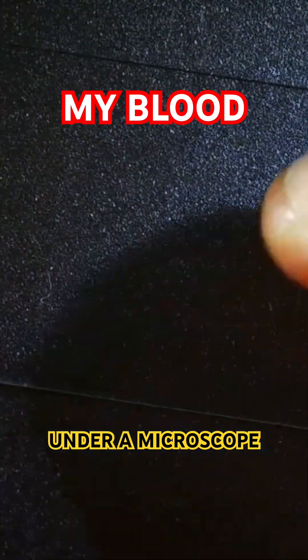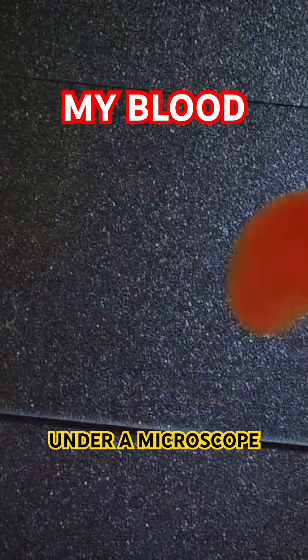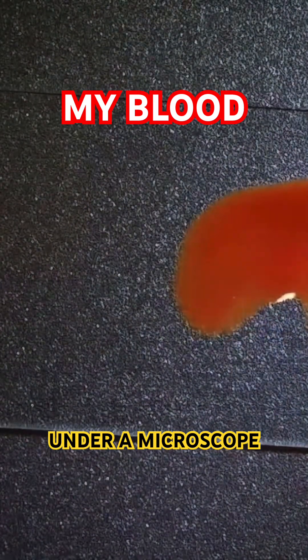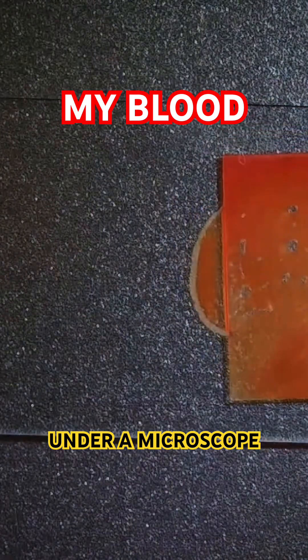That looks like a good amount right there. Look, is it? Yeah. Dude, that looks like hot sauce right there. And there it is. All right. You can kind of see this — I think that's pretty good.